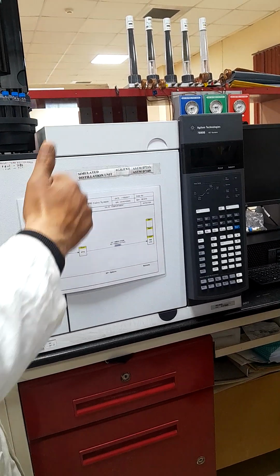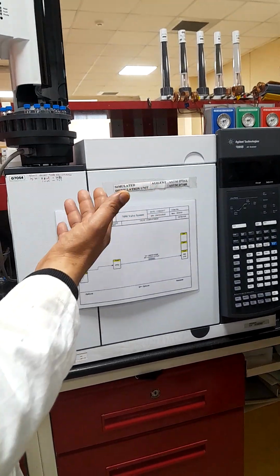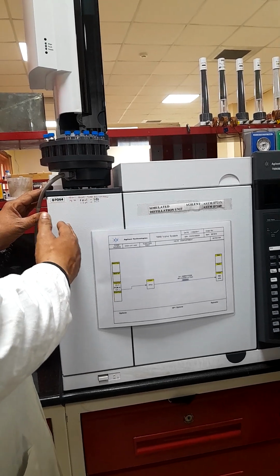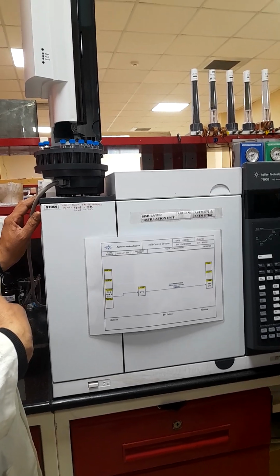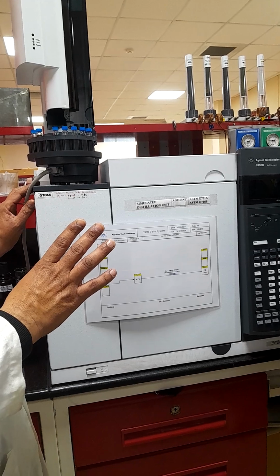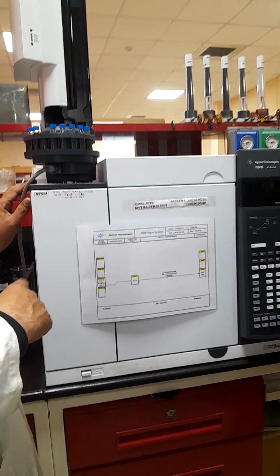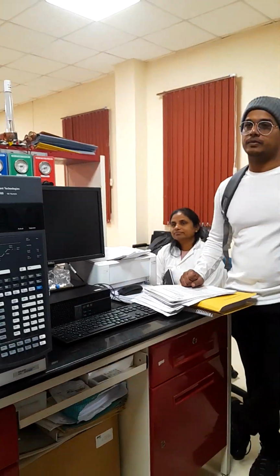And what is the role of air? It will work as a carrier gas. What is the role of a carrier gas? Whenever you inject your sample, it gets evaporated, and with the help of this carrier gas, air, it moves. Yes, we are using air as a carrier gas. Strange, I know normally you have nitrogen or helium, inert gases especially. It is not the air you feel in the surroundings. It is high purity air gas.